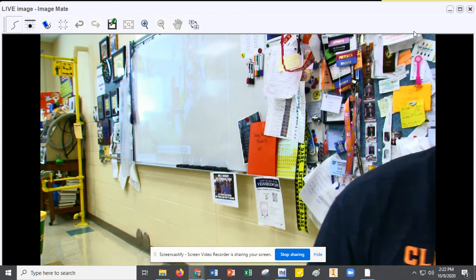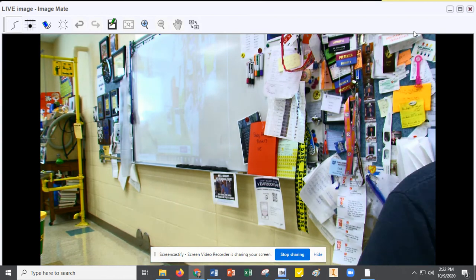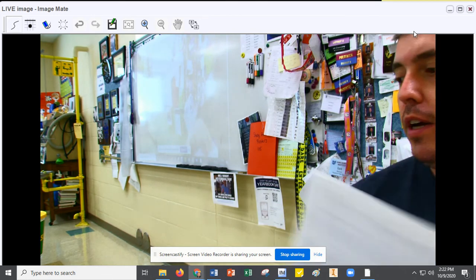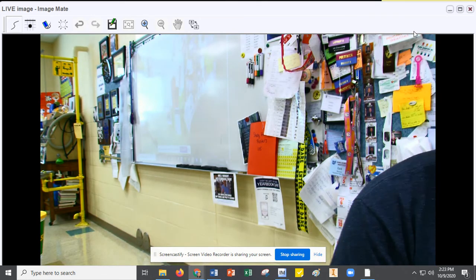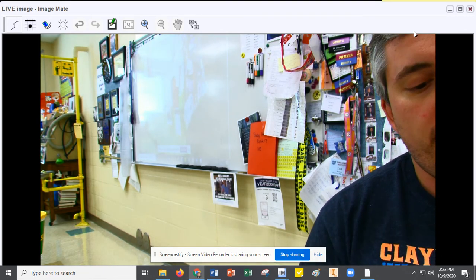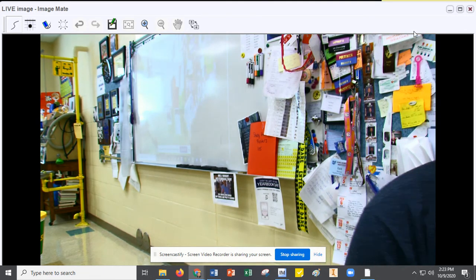Let's see, that's it. So those are all the stations. You have pre-lab and post-lab to do. And then based on what you have just seen, you will classify each of those stations as having been a chemical or a physical change.